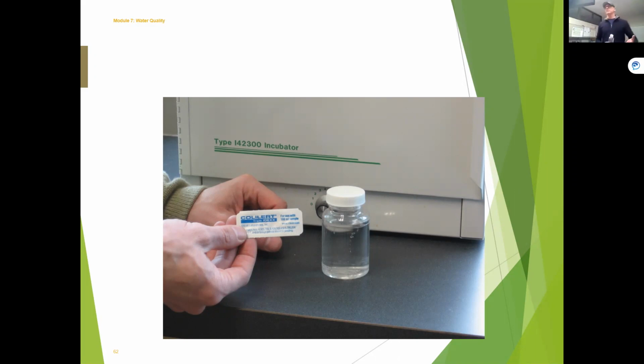My guys are getting ready to sample today, and this is a bacteriological bottle that I'm going to send to an accredited lab. It's going to be handled in the exact same way. The lid is nice and sealed. Basically, always wash your hands. You got your sample tap running. You're going to take the lid off, being very careful never to put your fingers on the threads or anywhere where the water would touch, else you could get a positive sample.